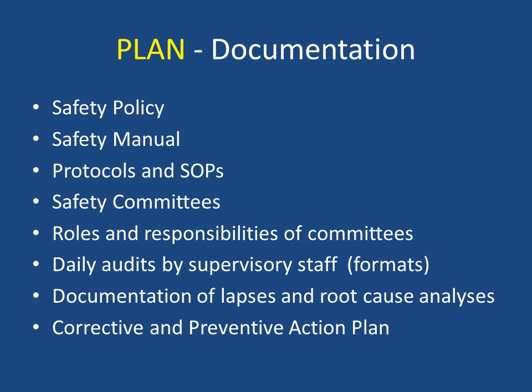At the laboratory level, daily safety audits can be performed by supervisory staff and the results documented in formats. An example of this activity would be how many staff are not wearing gloves when handling specimens. How many out of 10 observations? Are the defaulters the same people? After you have documented the lapses, you can have a root cause analysis and put in place corrective action and preventive action.